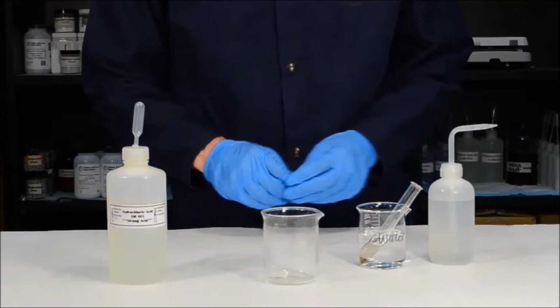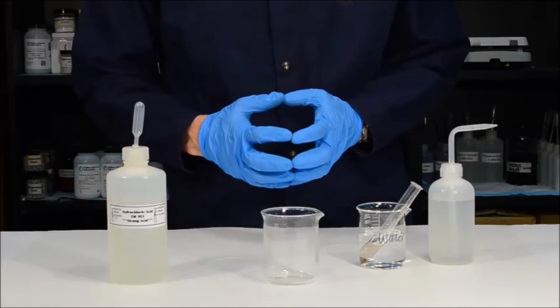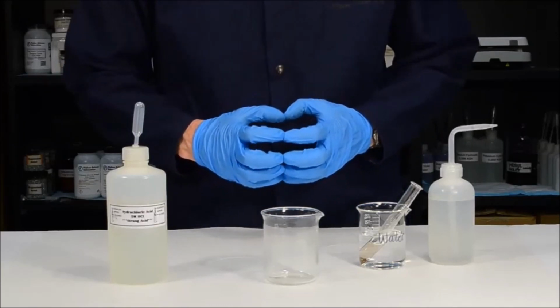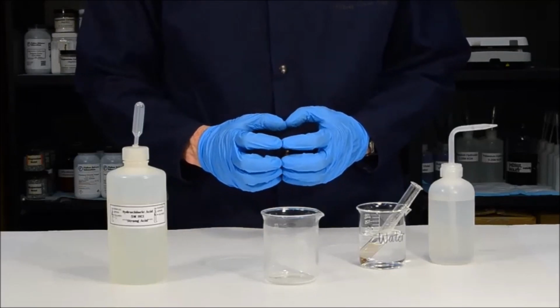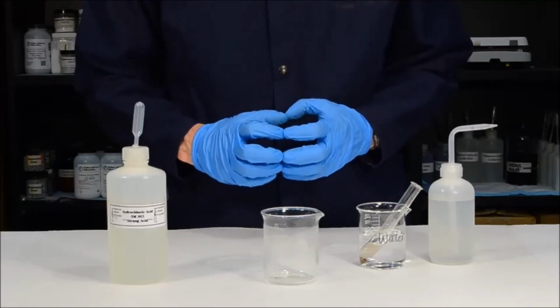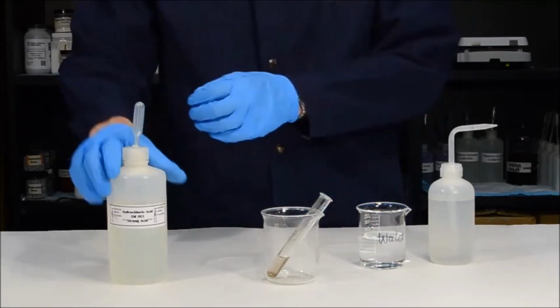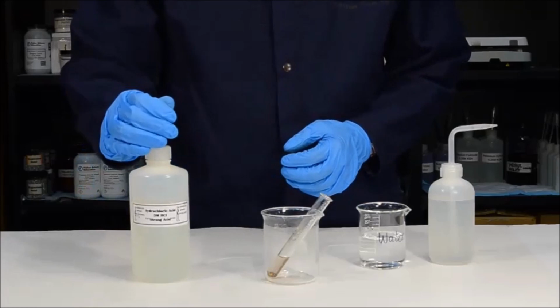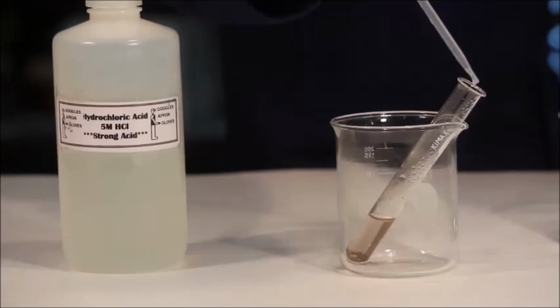After a couple minutes of the test tube cooling in the water bath, we're going to add HCl to the tube to destroy any unreacted magnesium. It's very important that when you actually do this part of the experiment, you're working in the hood. To do this, we're going to simply take our test tube and use 1 dropper full of 5 molar HCl in order to destroy the unreacted magnesium.